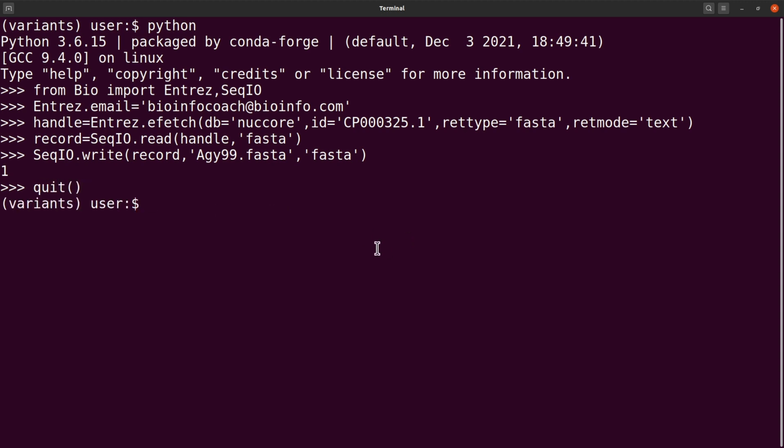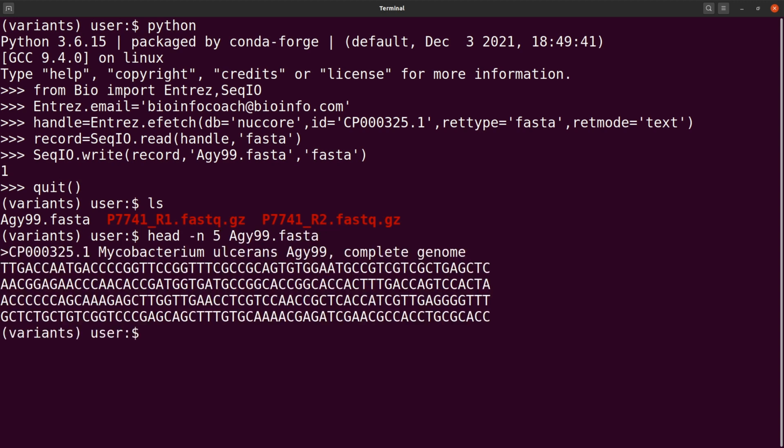And then we can now do an ls to check. And you see that we have it also there. So that's how we do it. Let's just do a quick exploration here. Let's just say head -n5 just to get it here. Okay, so we have the reference genome here, which is cool for us. So, I mean, we are good to go. So, a good job to everyone. Now we can proceed. So, let's clear the screen and then just continue.